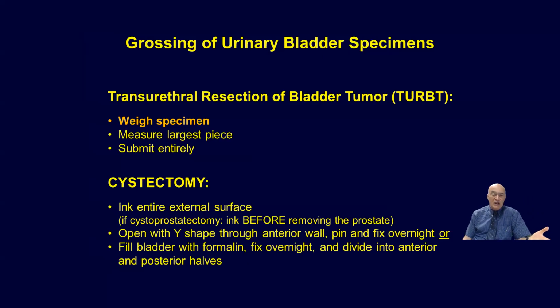There is a tendency, and I don't know where it's coming from, that pathologists, even outside pathologists, measure this kind of lump of very irregular fragments of tumor that, as I always say, it doesn't matter in which position you put them. It could look like a little cluster of tissue or like a flat tortilla, and in those cases the measurements are going to be completely different. However, if you weigh the specimen, it's always going to be exactly the same amount of tissue, because if the specimen is 2 grams, it's going to be 2 grams regardless of the form or the way that you want to put it on the dissecting table.